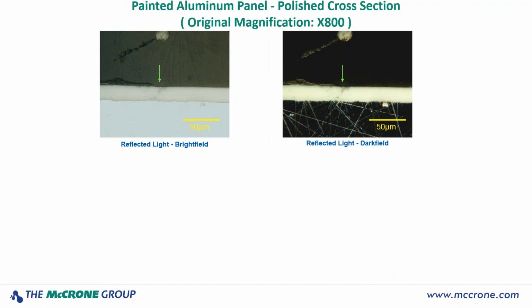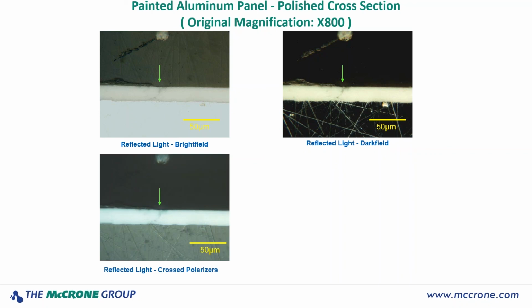For those of you that do metallography work and polish cross sections like this, and you look at your cross section visually and under the microscope with bright field illumination, you think, oh, it's a beautifully smooth surface, mirror finish. Don't ever look at it with dark field then, because you're going to see all the little scratches and defects from your polishing compounds highlighted very well. You can also use it, of course, as a quality control examination for your metallographic polishing. See how well you've really done.